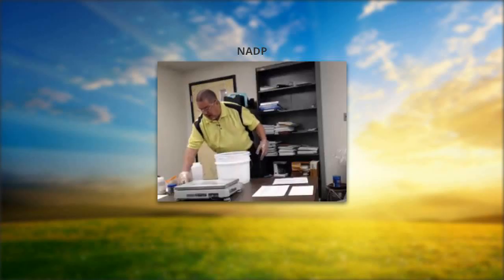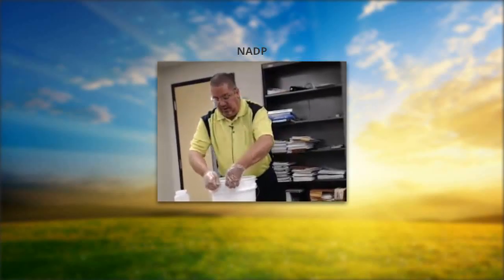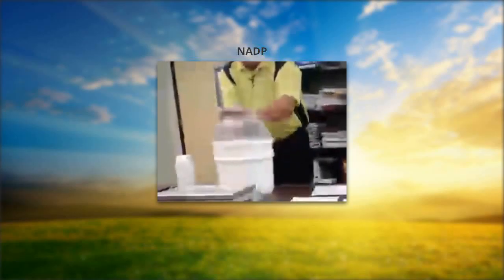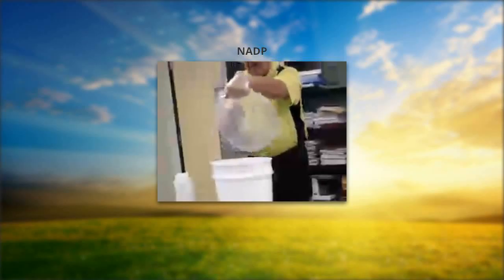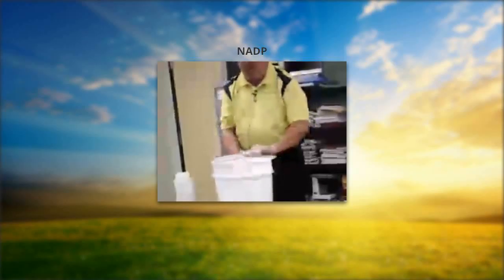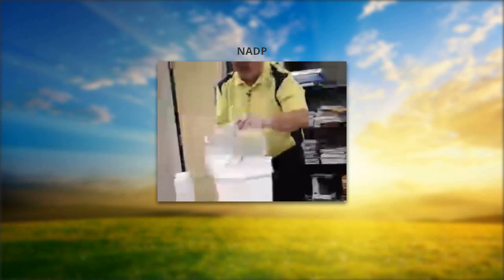I've got my bottle ready with the lid barely on. Now I'm going to open my sample bucket. When opening it, pull the lid towards you — and here's why: when you pull the lid off towards you, it acts as a shield for your arm, so if anything were to fall it would land on the lid, not in the bucket. If you remove it the other way, your bare arm comes across the top of the bucket, introducing contamination.